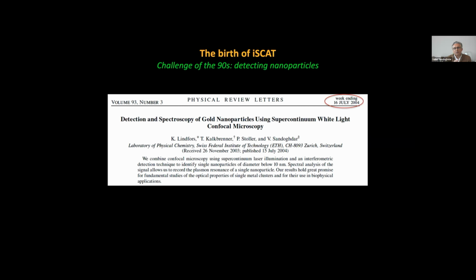And about 2 years earlier, Michel had shown that you could do detection of very small gold nanoparticles using photothermal, and this was fluorescence-free. And we were excited about this work because it was another version of fluorescence-free detection of very small particles.